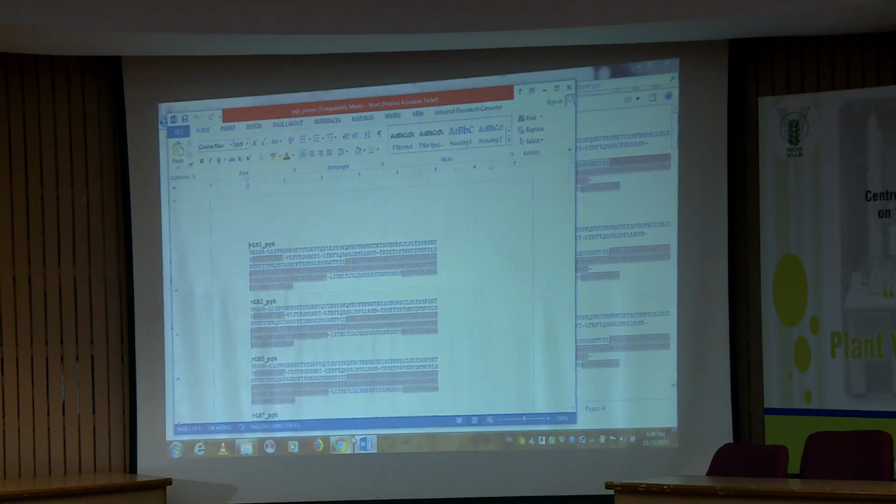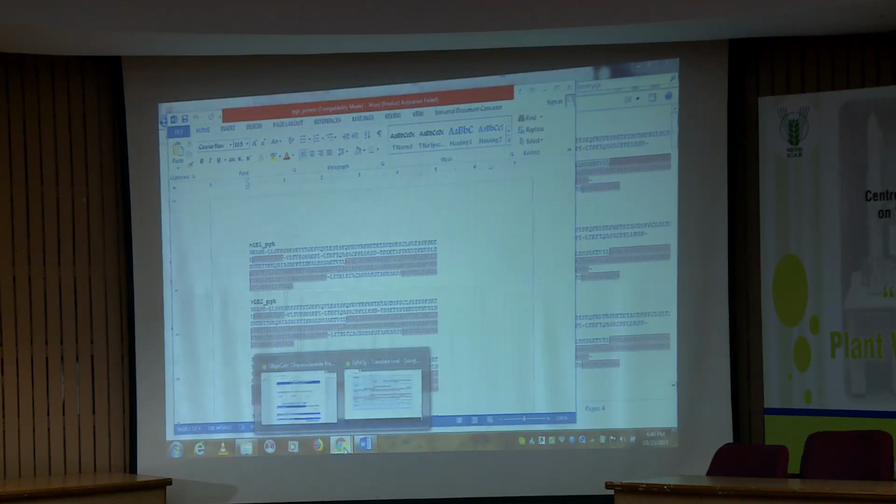At places where the initial codon is there, methionine will be there, right. The whole word methionine you have to replace with the code M, which it will specify while you are editing it.